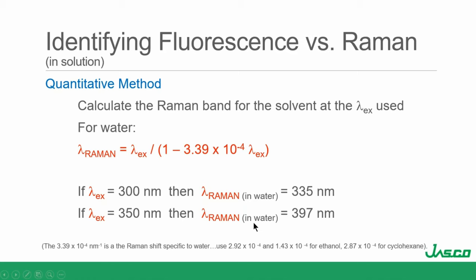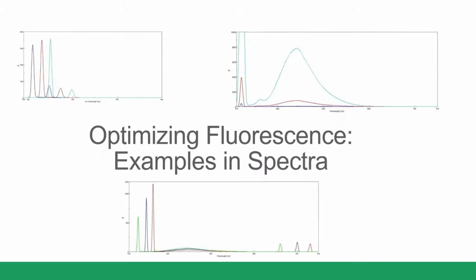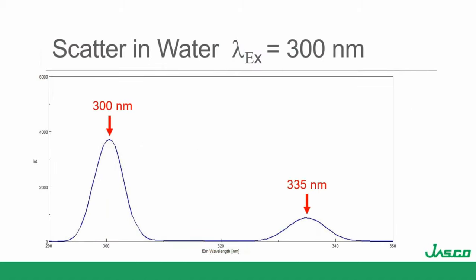Let's look at optimizing fluorescence in samples by looking at some example spectra. Starting with just the blank — just water. If I excite at 300 nm, this is a water scan. This big band at 300 nanometers is Rayleigh scatter — wherever I excite is Rayleigh. I should also see a second order Rayleigh band at 600 nm.